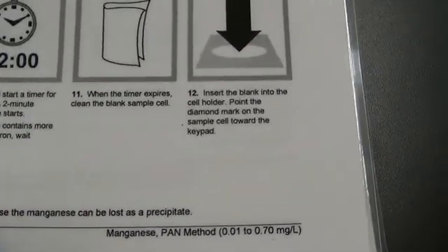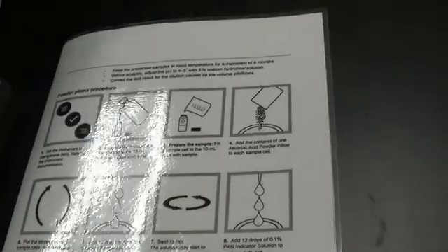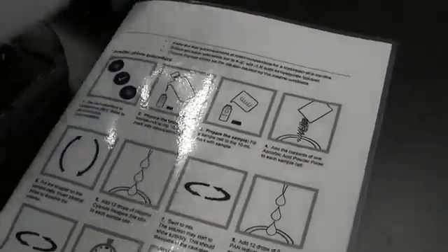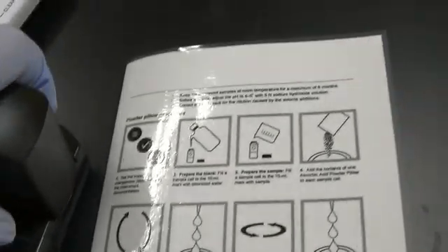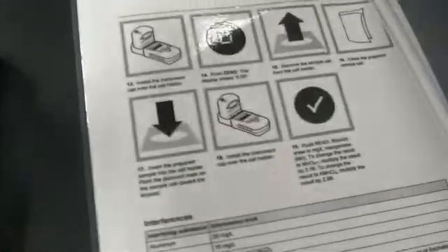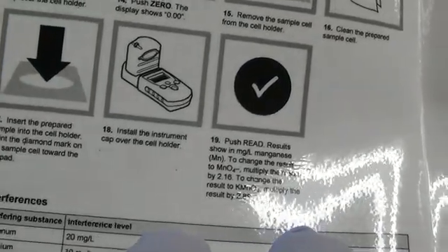Next, I wipe the blank cell and insert it into the instrument. I cover it and press zero to calibrate with the blank. Then I remove it, clean the test sample cell, insert it, and hit the check mark to check the manganese level.